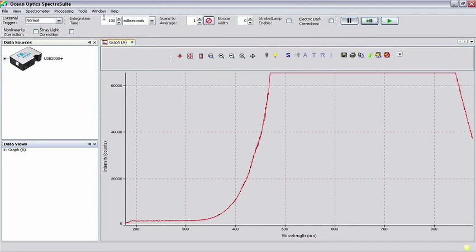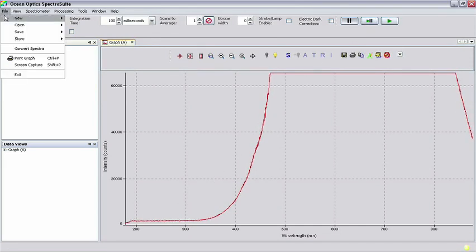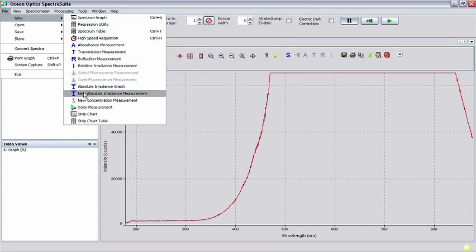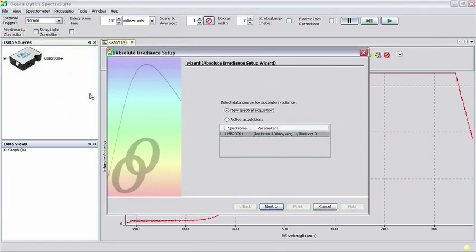To begin the radiometric calibration, click on File, New, and New Absolute Irradiance Measurement in the menu. You will see the Absolute Irradiance Setup dialog box appear.